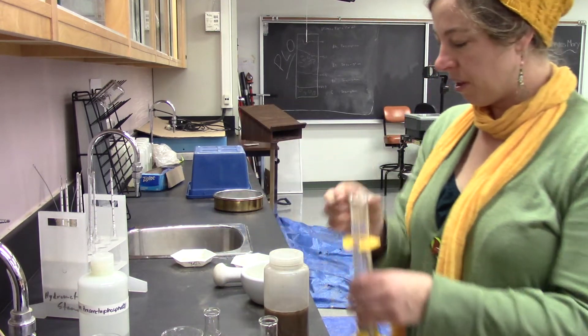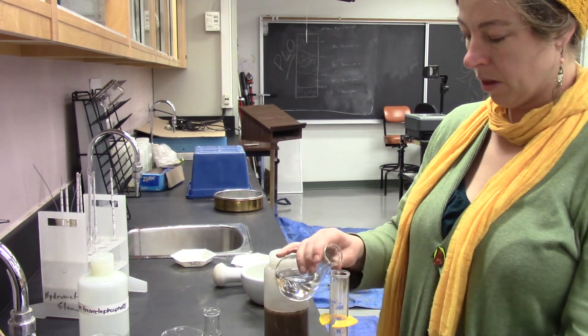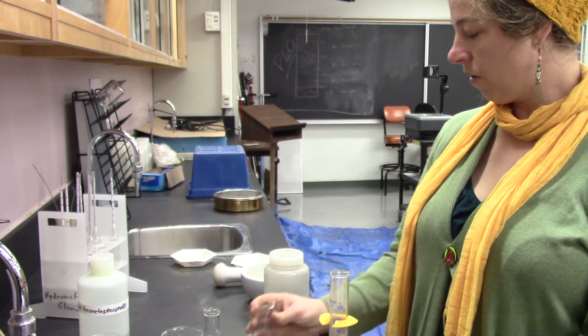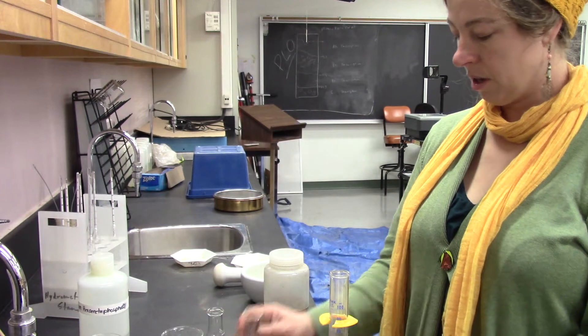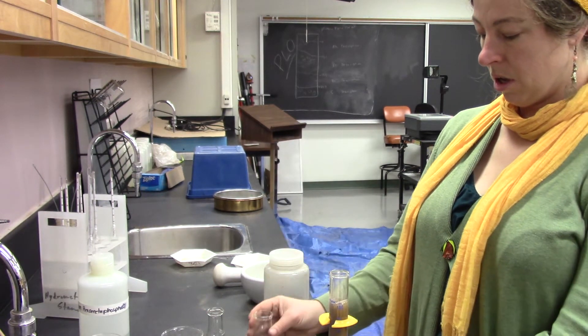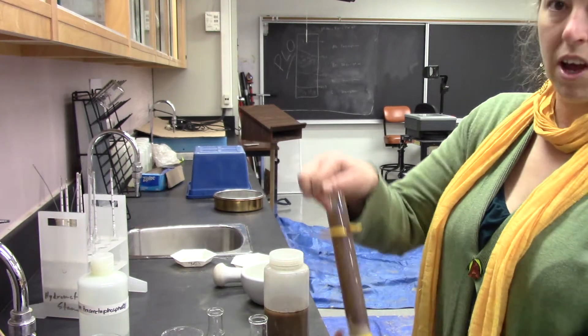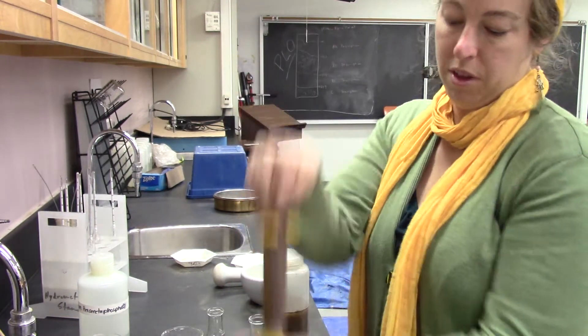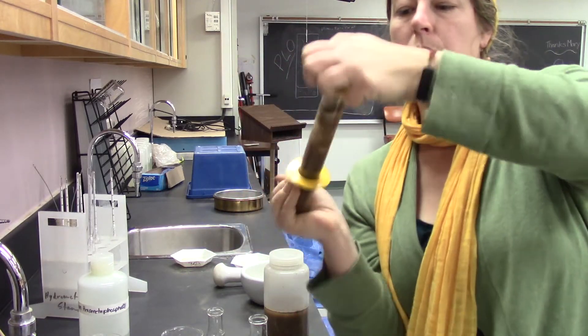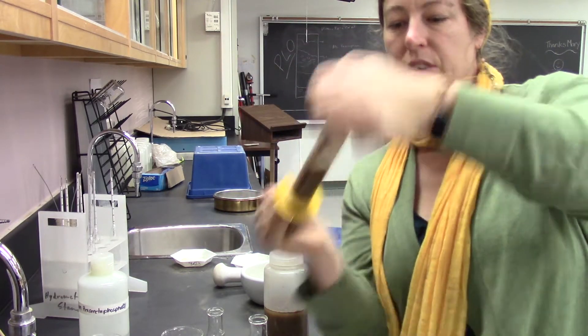I'm going to do the same thing with this one. I measured enough for a hundred this time. It's going to be a little harder — I'm going to try and do it this way, but a narrower column becomes more difficult.